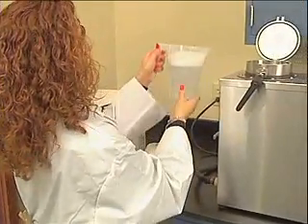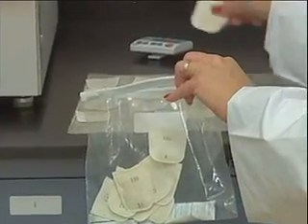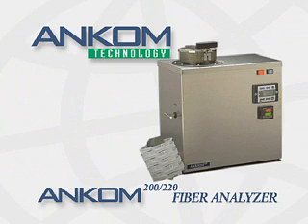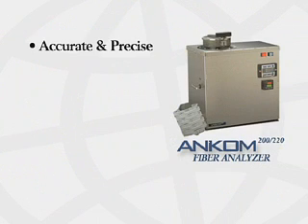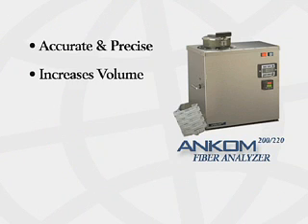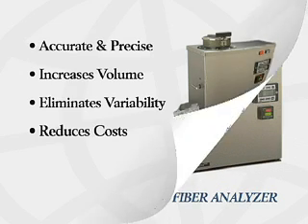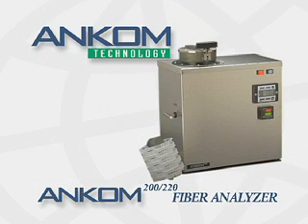One technician, 24 samples, precise and accurate results. To summarize, the ANCOM fiber analyzer provides accurate and precise results, increases sample throughput, eliminates technician variability, and reduces overall costs. The ANCOM fiber analyzer will make your laboratory more efficient and economical.